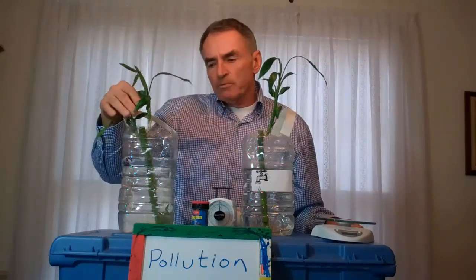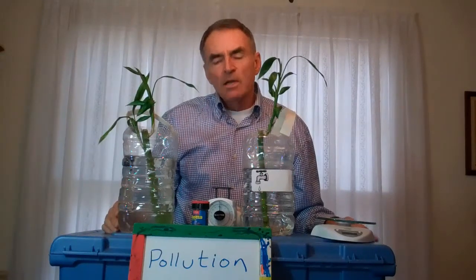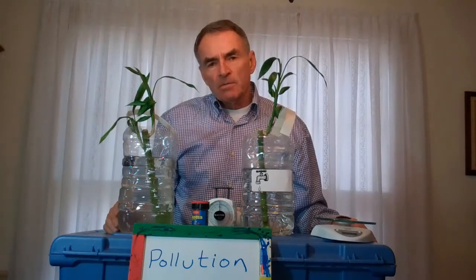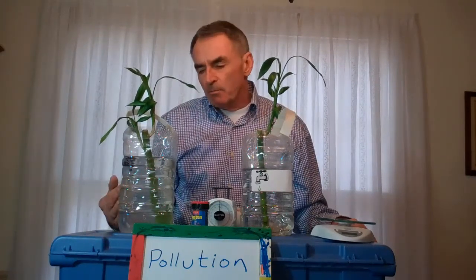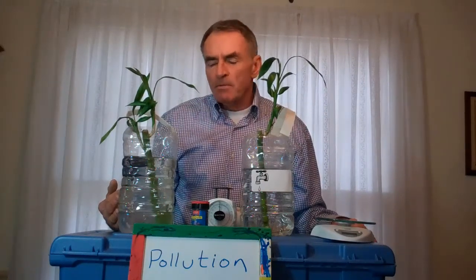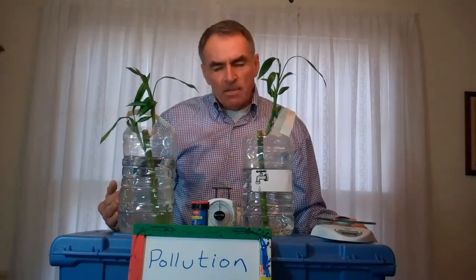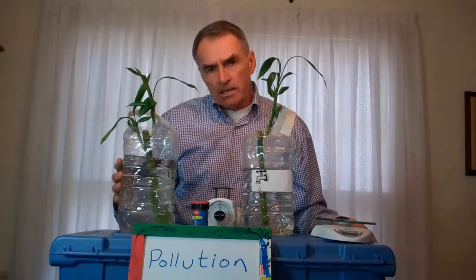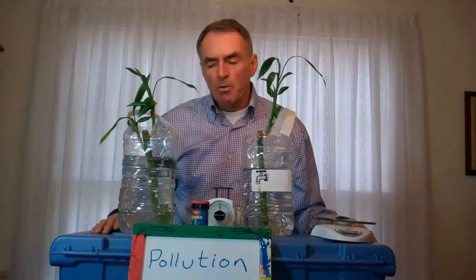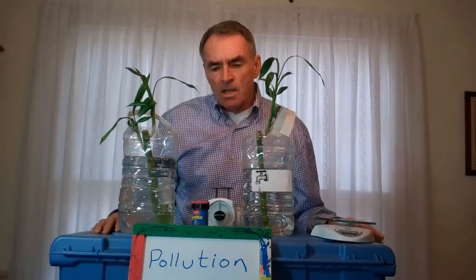Each group of students will weigh one of these plants, check the calibration on the scales, weigh, and record on the data sheet, and we'll do the same thing in terms of adding up the weight of the plants, and then looking at the sum and subtracting from that the sum of the weight of the biomass at the beginning of the experiment. And if things went according to plan, these plants will have gained more biomass during the experiment than did these, which did not have access to nutrients.